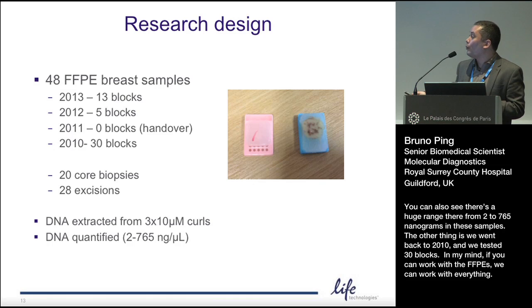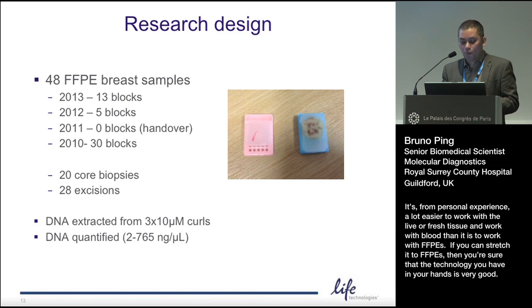The other thing as well, we went back to 2010 and we tested 30 blocks. In my mind, if you can work with the FFPEs, you can work with everything. From personal experience, it's a lot easier to work with live or fresh tissue and blood than it is to work with FFPEs. If you can stretch it to FFPEs, then you show that the technology you have in your hands is very good. So let's move on.